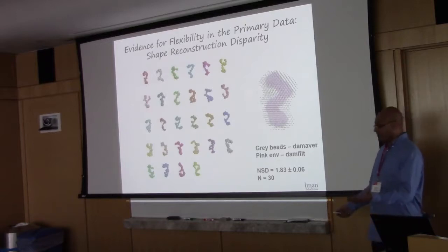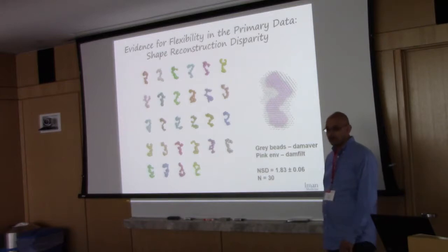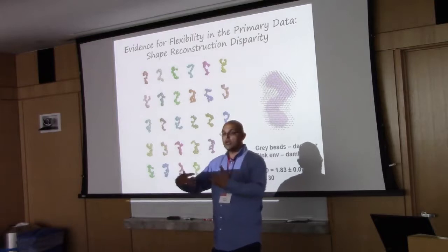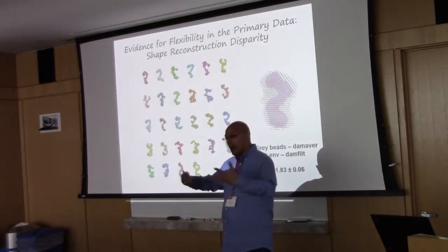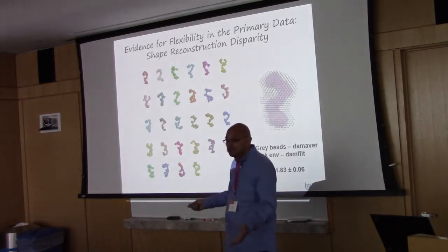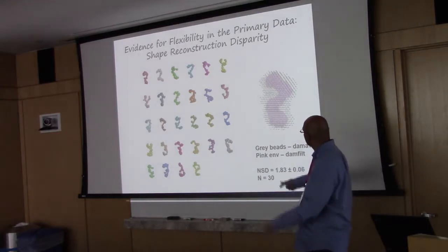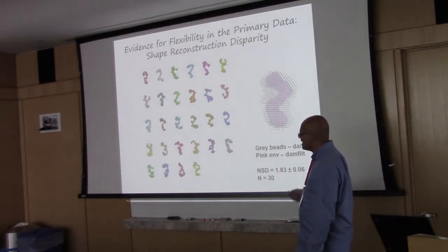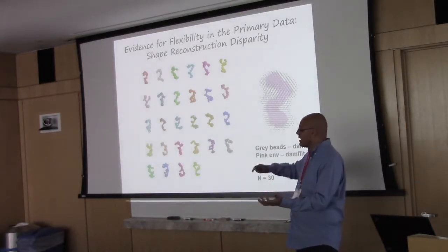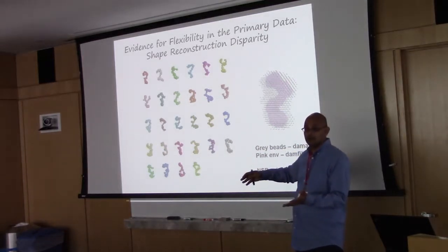So the first thing I did, of course, was, hey, I'll run this shape reconstruction. I ran 10, and the NSDs, normalized spatial discrepancy figures, which measure the agreement between two calculations at a given position, were very high. So you couldn't average them together. I tried 10, 20, 100, and I kept getting disparate solutions every time. All had good chi-squares, but at the end of the day it wasn't a very compelling solution. And this is because it's intrinsic disorder. I showed you the Kratky plot or the Porod-Debye plot, all the signatures of a very floppy protein solution.